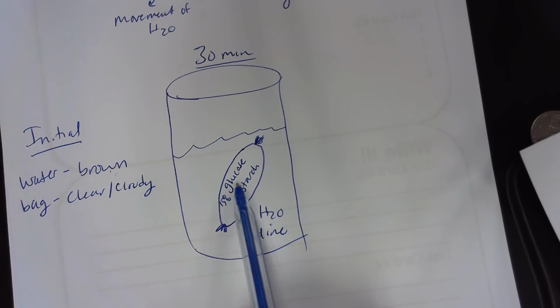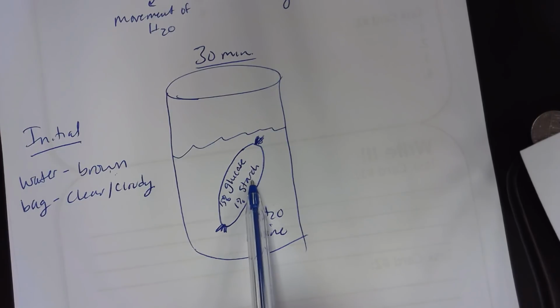Let's look at the glucose and the starch. In here, the glucose and the starch, obviously, if we remember back from carbs, are two different sizes. Glucose is rather small, very, very small. You put several hundreds and thousands together and we can make starch. So starch is our big polysaccharide.